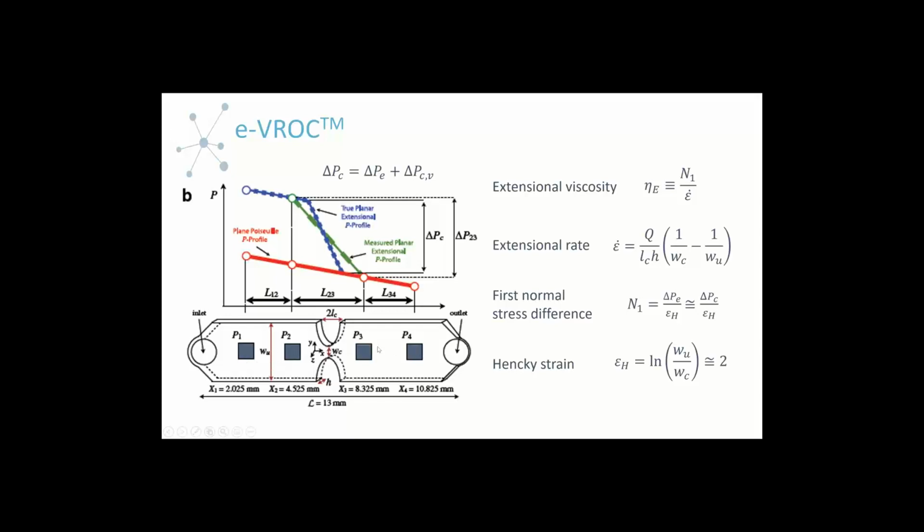When we look at the pressure drop across the length of the flow channel, unlike the uniform channel where we have a linear relationship when all is well, in the extensional chip you have a more significant pressure drop across the flow channel region, between pressure sensors 2 and 3. So we're never going to see a nice linear relationship across all 4 sensors. We'll always have this more substantial drop in the center portion of the flow channel.